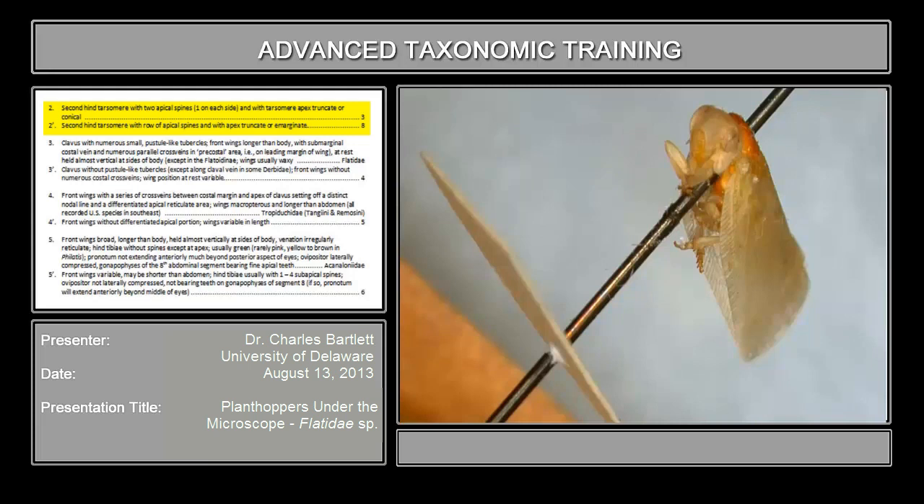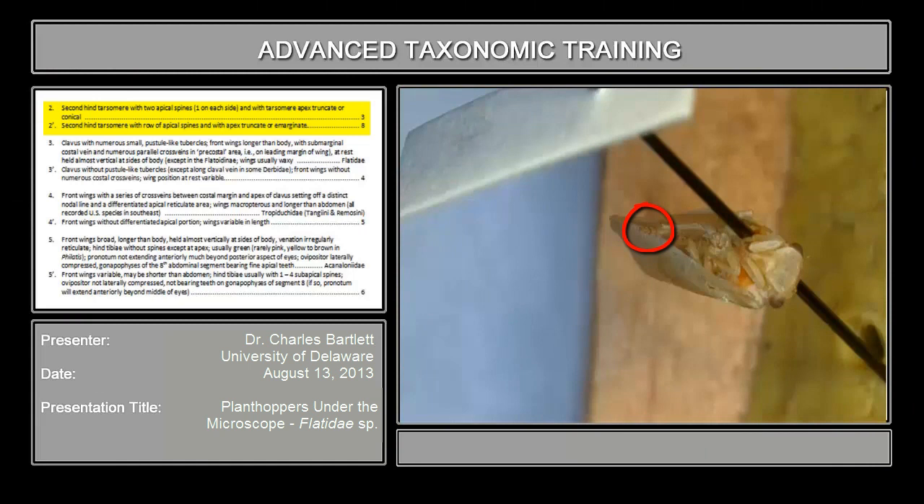You need to be looking at the ventral side of it. I'm going to pull another specimen over. Again, you have hind tibia here, first and second tarsomere. You should be able to see — if not on screen, at least in the specimen in front of you — that the second tarsomere bears a pair of spines as opposed to a row of spines, and the apex is a little bit projected, more conical. Also worth pointing out: you can see the hind tibia has a couple of lateral spines, which is a family-level and sometimes genus-level feature in groups of planthoppers.